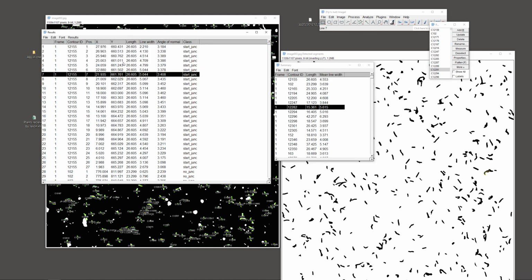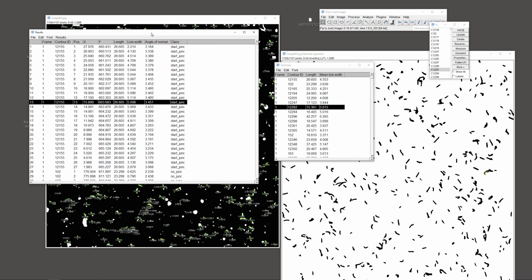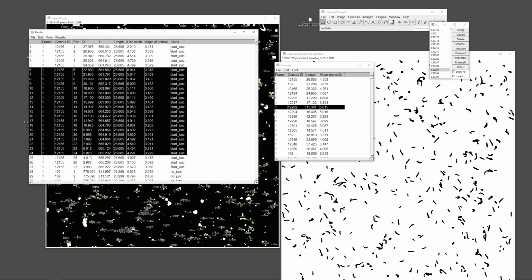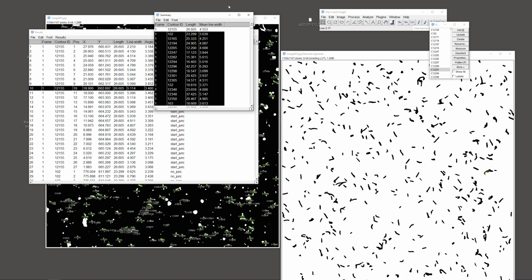This one is the more detailed one, with where it starts and where it ends, but I know that these details are not that important as you are working with the slide and cover slip, so it doesn't give you good information. So I think the summary tab is better, and you can keep the length and also the width if you want, as the circular parts or objects are not counted. So this will be better. Hope it helps. There's another way that I'm going to explain in a moment.